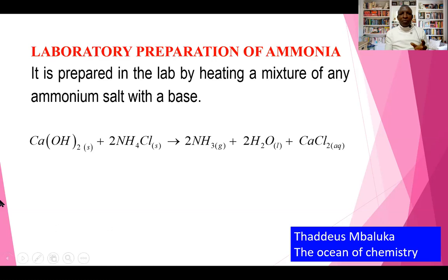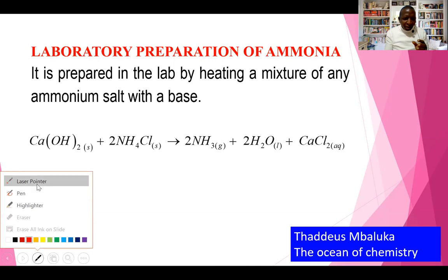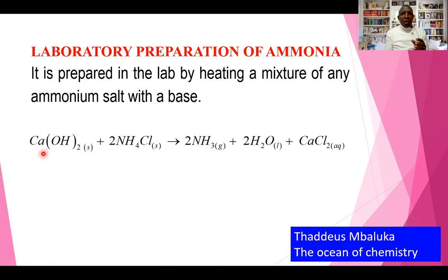We are looking at the reaction that takes place here: calcium hydroxide reacting with ammonium chloride to form ammonia plus water plus calcium chloride.